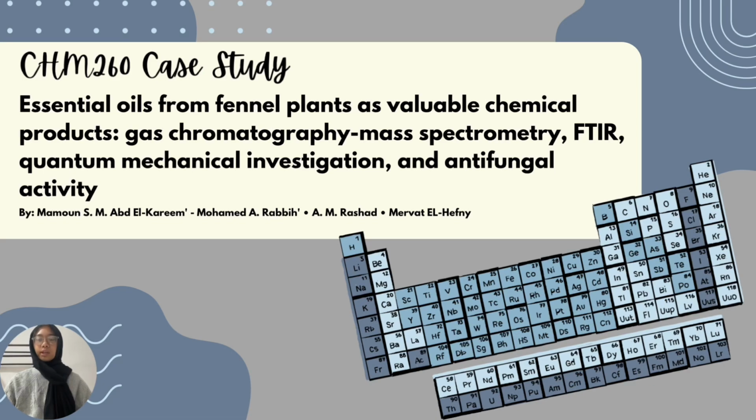In this video, we are going to present an article titled Essential Oils from Fennel Plants as Valuable Chemical Products, Gas Chromatography, Mass Spectrometry, FTIR, Quantum Mechanical Investigation, and Antifungal Activity.